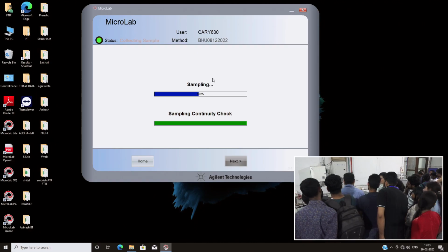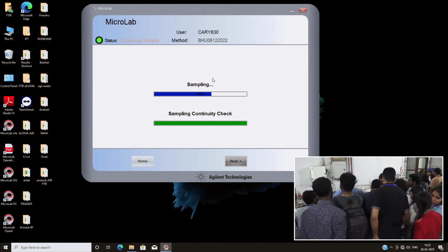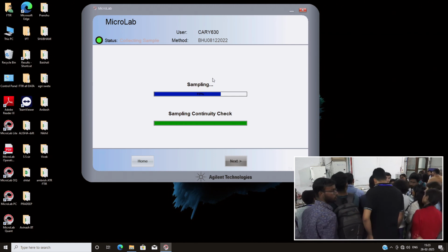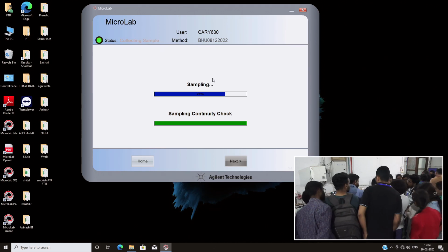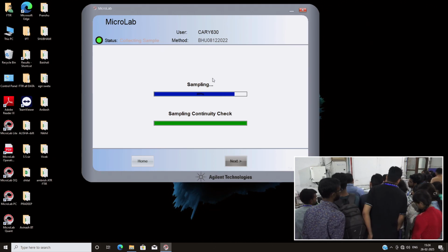Okay. During measurement, since the width of the film varies, we cannot ensure that it's always the same.